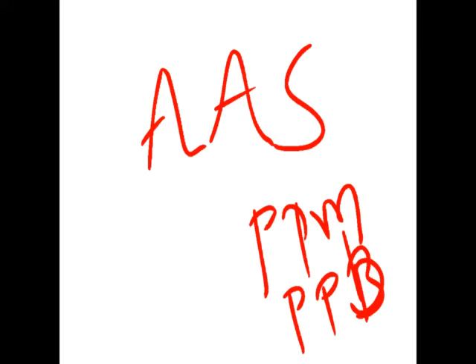If sodium and potassium are both there in the given sample, it will not give the exact value of sodium ions in flame photometry. So we have to first separate sodium ions and potassium ions, then go for flame photometry. That was a disadvantage in flame photometry.